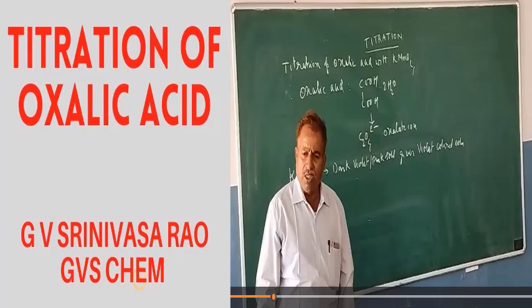In this video, I am going to explain the titration of oxalic acid with potassium permanganate, which is very useful to the board practical examination, which is scheduled in the month of January and February.